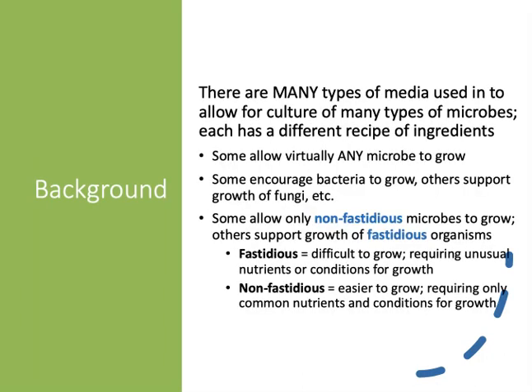There are many, many different types of culture media that are used in the microbiology lab. They allow us to culture all different types of microbes, and each type of media has its own unique recipe. Some media will allow virtually any microbe to grow. These are the types of media that we often refer to as growth media. There are some types of media that will encourage just bacteria to grow. There are other types of media that are designed specifically for fungi.